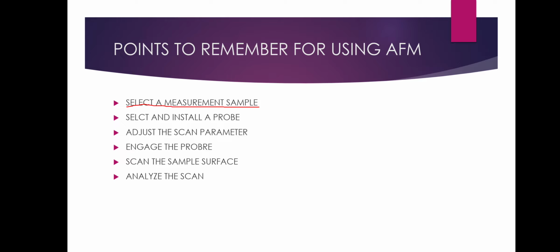And the next one is engage the probe. In some systems, we as operators need to manually lower the probe. So we need to manually lower the probe. We need to engage the probe while reading the sample surface. So we need to engage the probe properly.